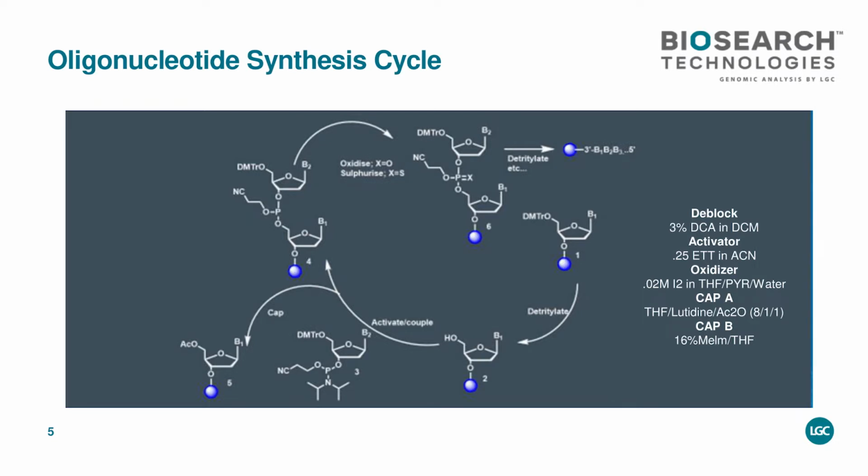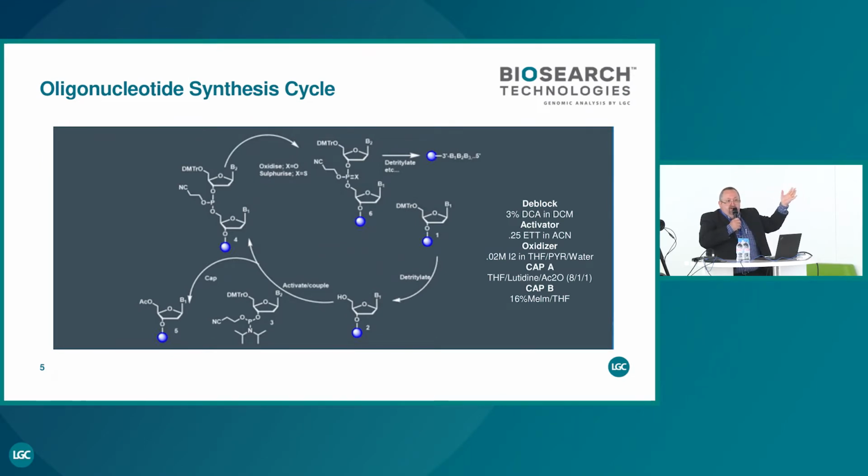The oligo synthesis cycle. This is quite simple but complex at the same time. This is really a nice thing because it's just a cycle. You start the process, it continues. So imagine you have the solid support. Here it's my hand, and there is a protective group, the DMT. The first step is to make a detritylation, so to take off the dimethoxytrityl. So you take off the dimethoxytrityl, and so you have an active site. The second step will be to make the coupling and the activation.